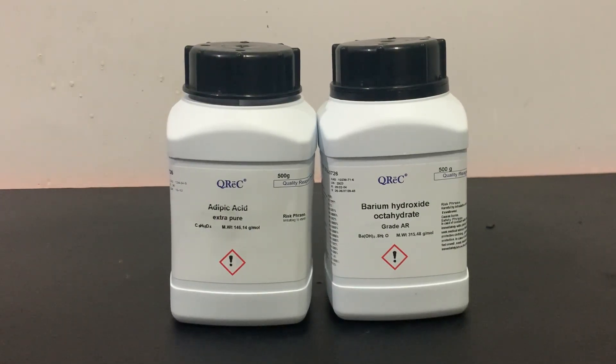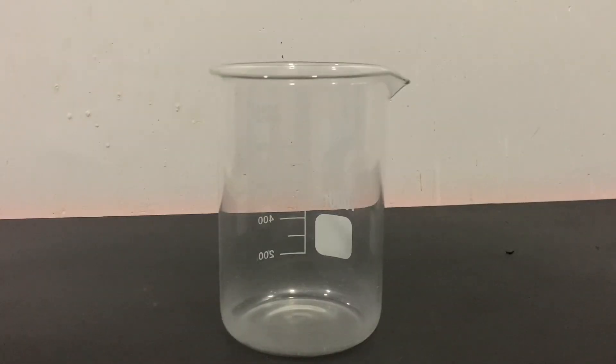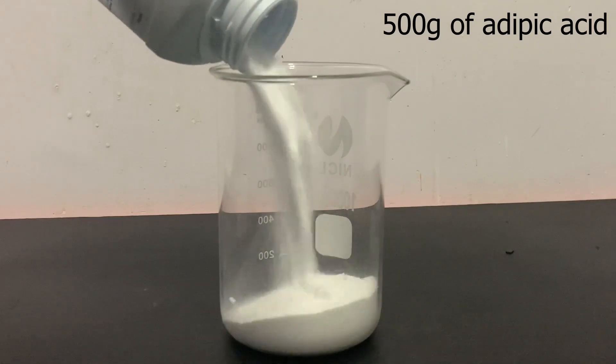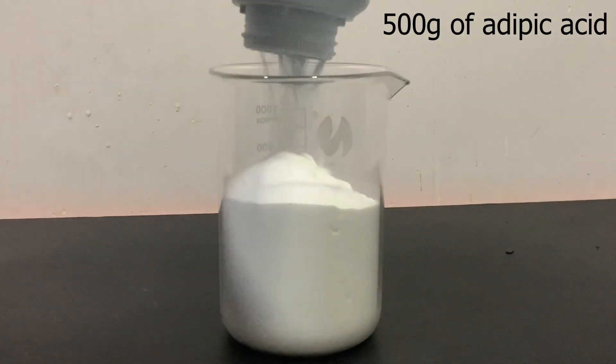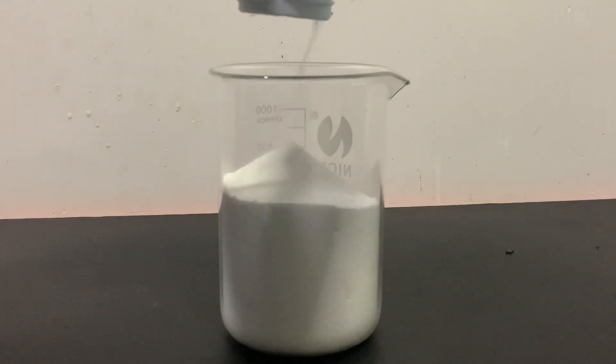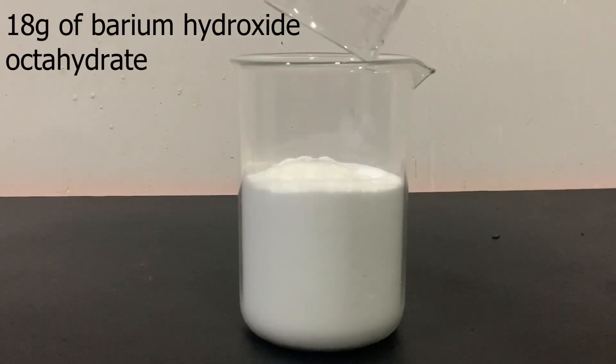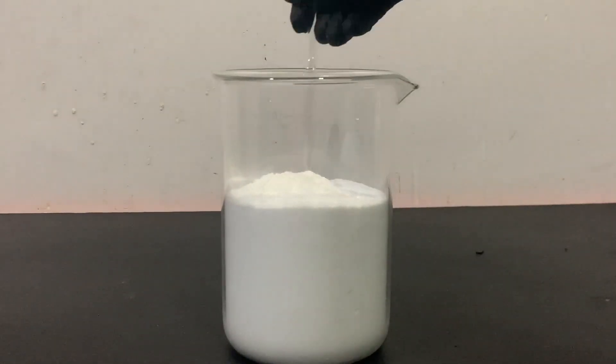For the synthesis, I'm going to use 500g of adipic acid along with 18g of barium hydroxide. Both of these powders are transferred to a large beaker. They are then mixed together.